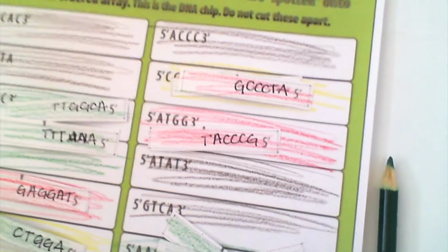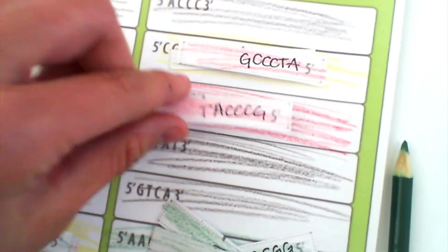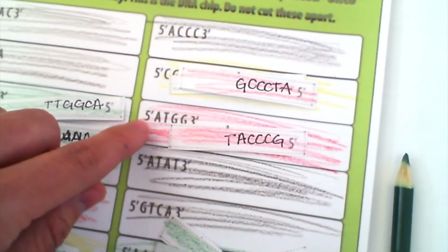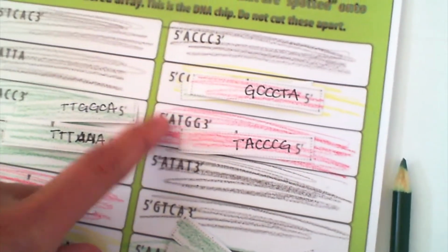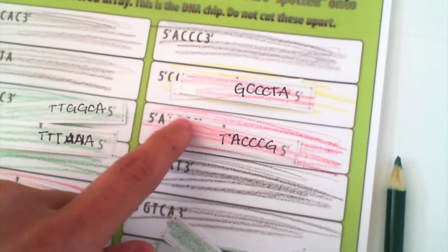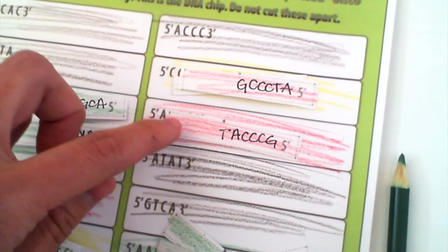Moving on, we are given this gene right here. There is a cDNA from the plant with no light, and that is it. So hence it is going to fluorescently shine red, meaning that this gene is overly expressed in the plant with no light. So this will be a gene of concern, to look at to see how this alters the plant's functionality in regards to no sunlight.